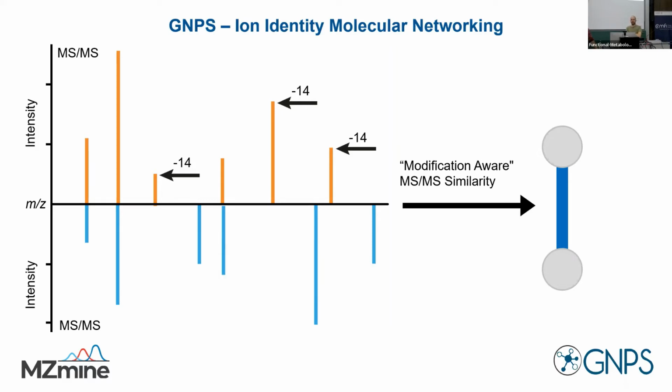Thank you. So there were a couple of settings yesterday in this molecular networking job that we submitted that we did not really question. We just left them default. But first of all, you define the cutoff of the similarity score, up to what value nodes are connected. By default this was 0.7, but you can of course increase or decrease that. And then you will get either more stringent, or very loose with more false positive connections. And then there's another very important setting that is hidden under the advanced tab.